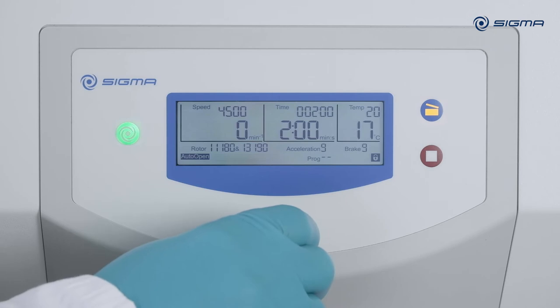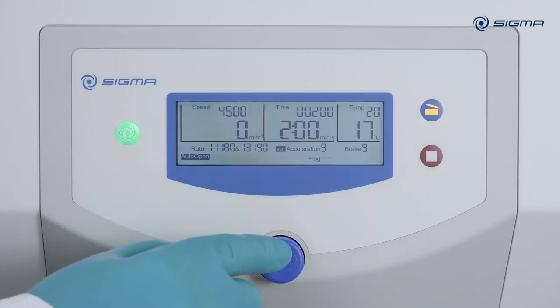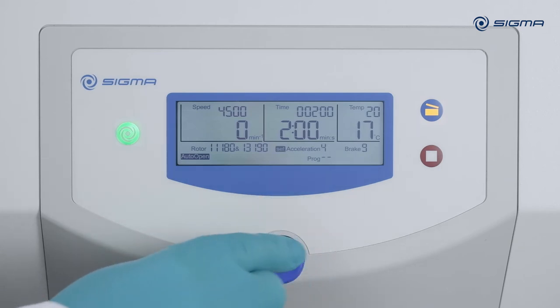To change the acceleration curve, turn the knob seven clicks to the right. After you press the knob and make the setting, the new acceleration curve will be accepted. Number nine is the fastest acceleration.